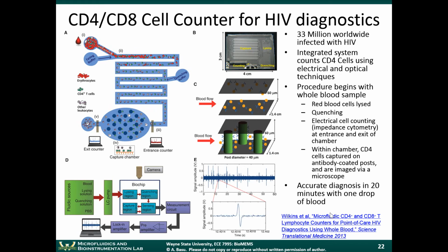This is an example of an integrated system. This was published last year in Science Translational Medicine. It uses some of the technologies that have been developed earlier by other researchers. It gives you an idea of what can be done with these microfluidic technologies.